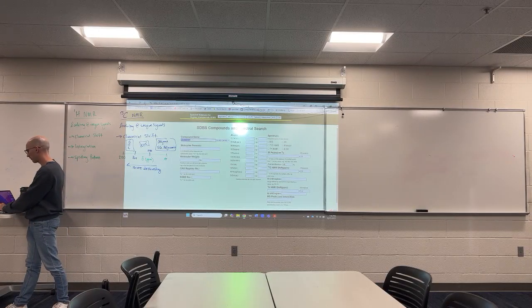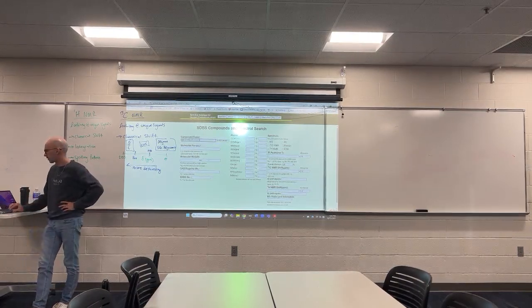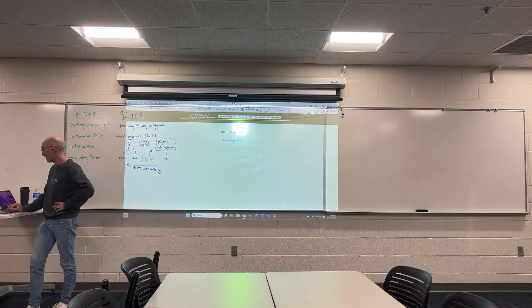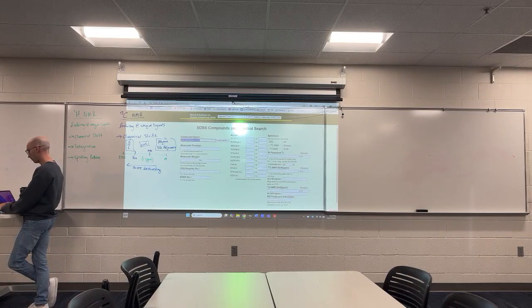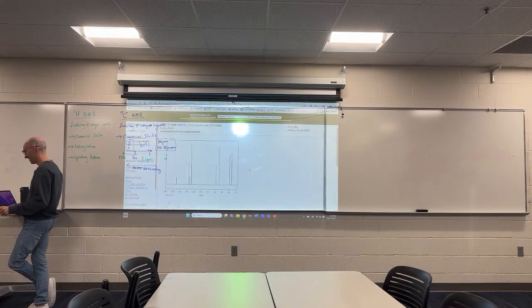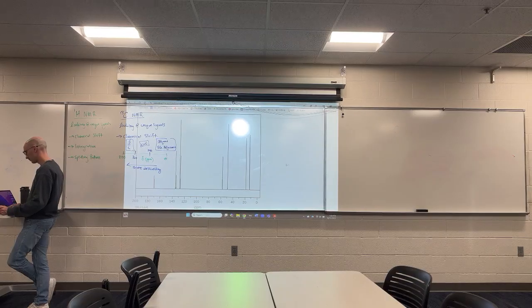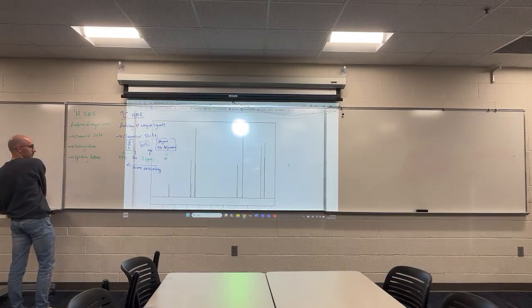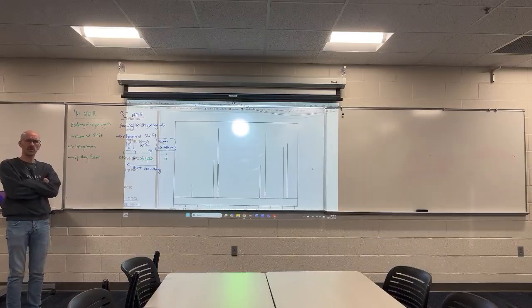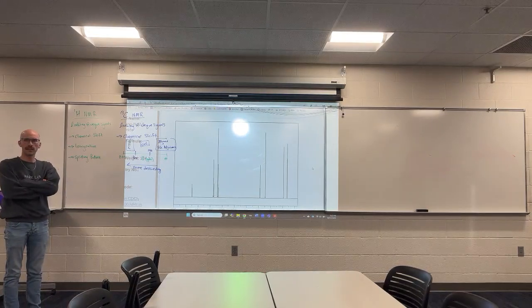I'm not sure why I'm not finding benzocaine on here. But let me try for another compound, and we'll look at its carbon NMR. Okay, I don't know. You know that it shows up? Great, thank you. All right, here's our carbon NMR for it. It's a lot cleaner than the proton NMR. How many unique types of carbons do you think lidocaine has?